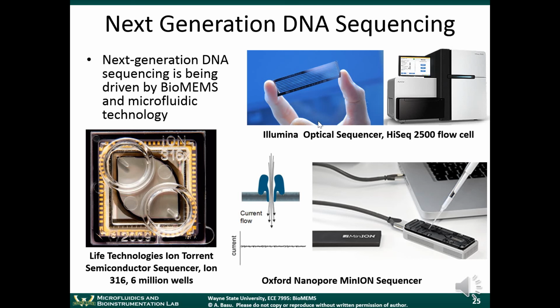You do this assay called sequencing by synthesis. If I go into the details of it right now, it might become quite confusing. But it basically uses an optical technique. There's a flash of light that occurs when a certain base is incorporated into the genome. They try to match nucleotides with complementary bases in the genome. If this doesn't make sense, don't worry about it. But this technique allows them to sequence DNA samples at a manageable cost. It's still quite expensive, but not nearly as expensive as the $1 billion for the Human Genome Project.